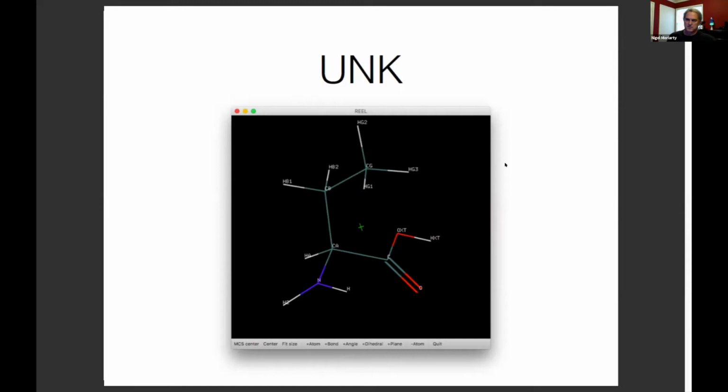This is a cut-down protein amino acid that is often put in there if you don't know what is actually the amino acid in place. But you should know that this is what it actually is. It has these atoms and these atoms only. You can have less, of course, but you can't add other atoms to it.